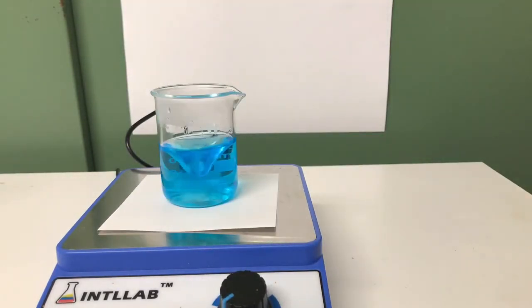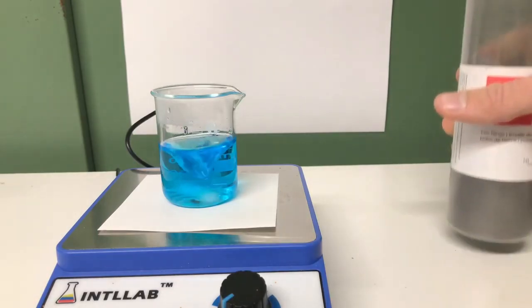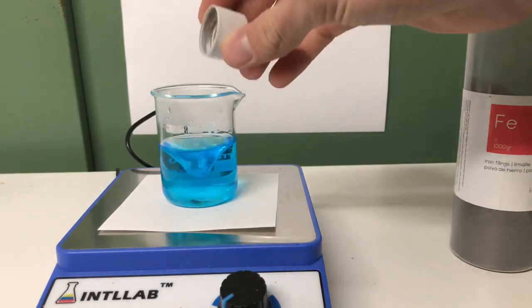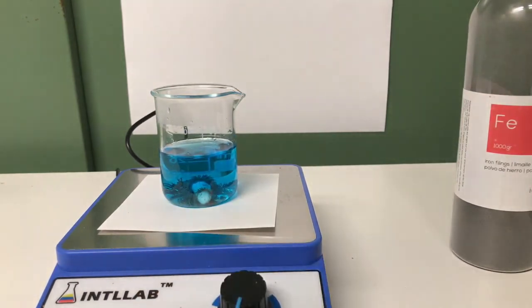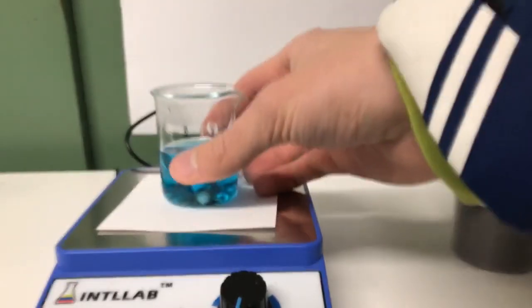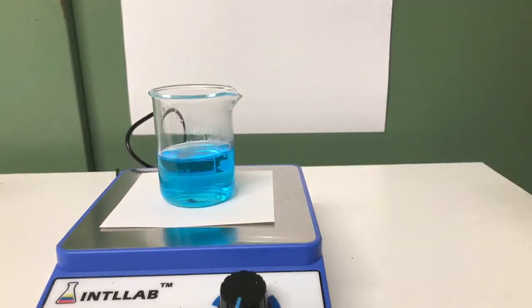Before adding your iron powder, remove your stir bar because it is magnetic and you will see what happens if you don't take it out before you add your powder. It will make your magnetic stirrer stop moving.